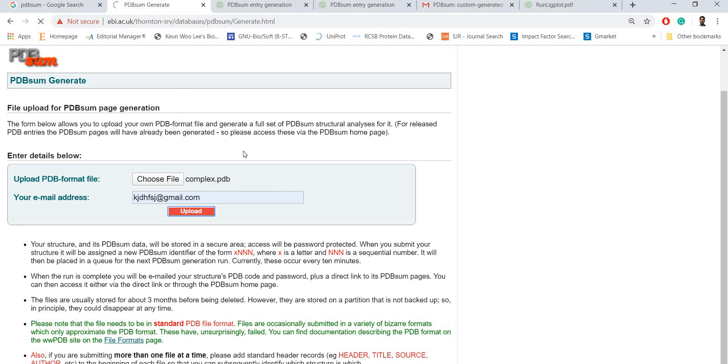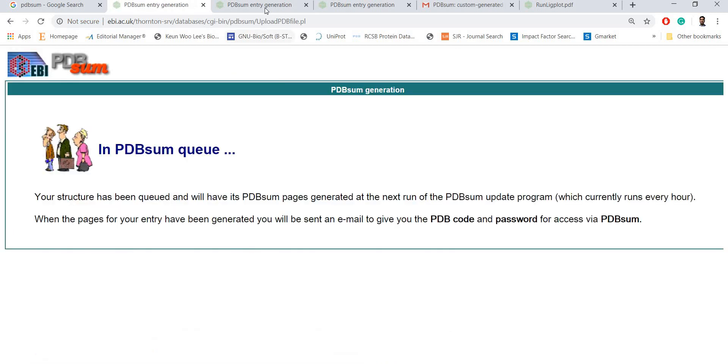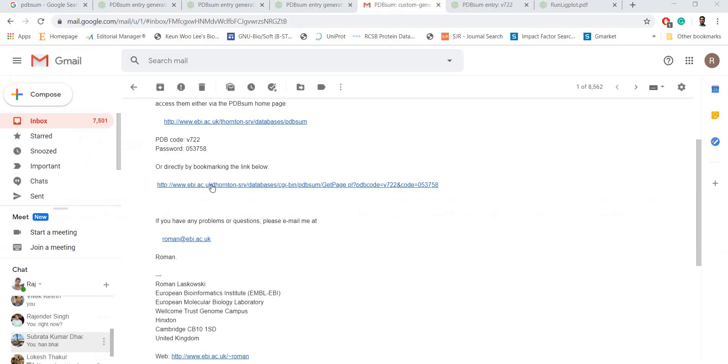It might take several minutes, five to ten minutes. I have already completed this. You need to open this link which is given to your email by PDBsum.